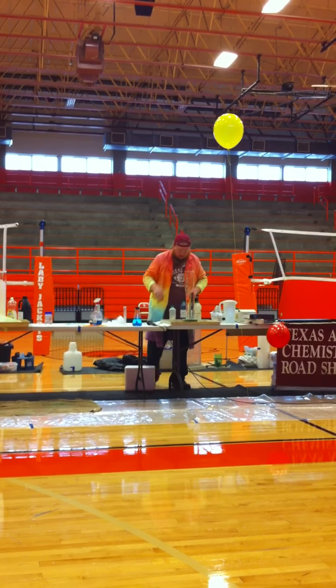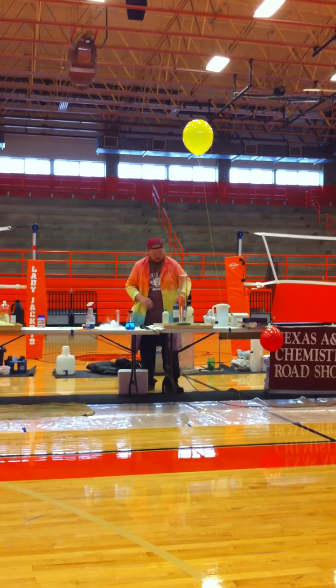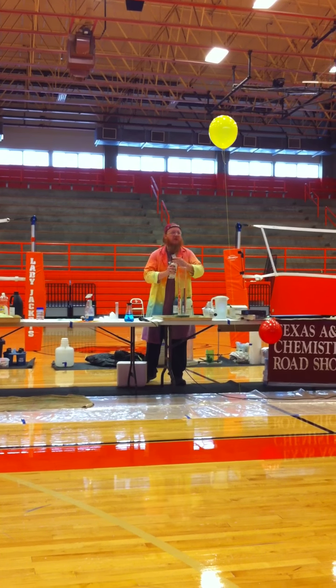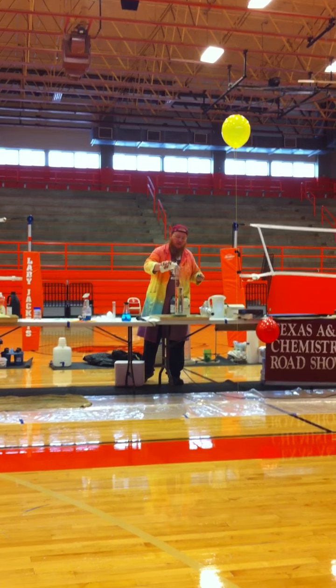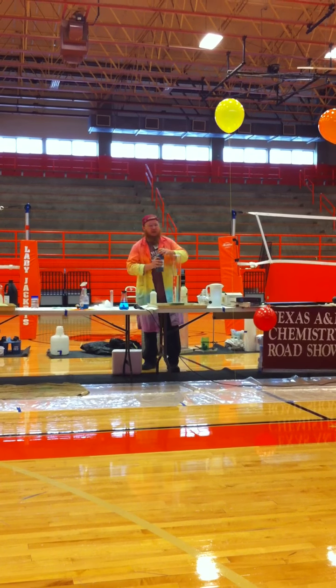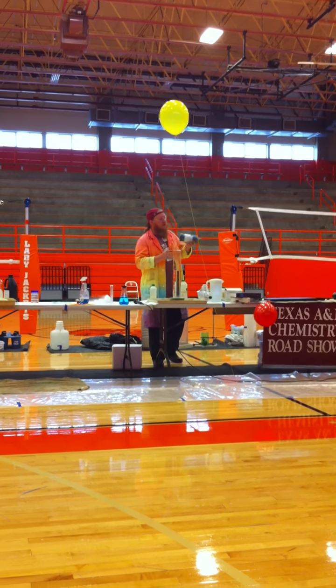So I'm going to, in this graduated cylinder, first put a little bit of base, a little bit of sodium hydroxide. We used to call it lye before. Probably put a little bit too much in actually. Yeah, it'll work eventually. The next thing I'm going to put in is a universal indicator.